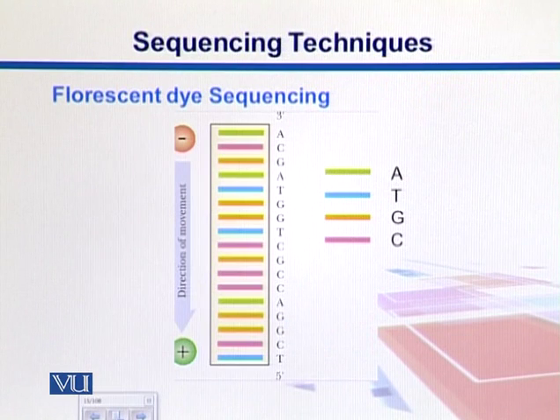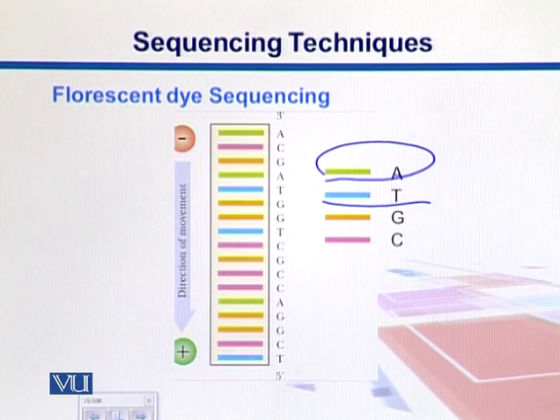So here is how it looks. For example, we take the primer for adenine and color it with this green color, and this is T, and obviously G and C. We put them in the same lane, and only the color detection can tell us which nucleotide is there. You don't even need to compare with the markers.